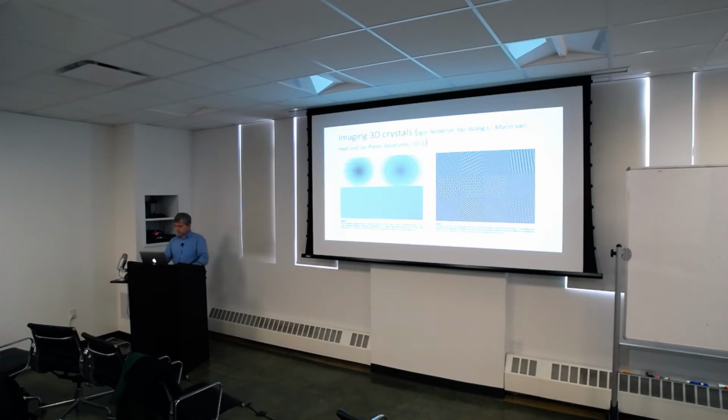The full experiment is this whole series of images with many spots, and I'm not sure if having estimates of the phases for only one or two of them would be enough to jumpstart the process or not. I haven't done that myself, so I'm not sure.